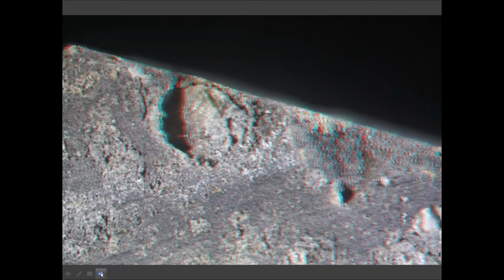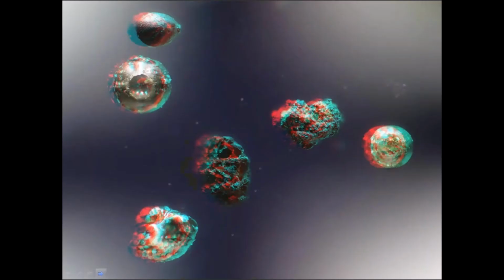Another great application is geology. This is a meteorite from the moon. And you can see the surface is really, even though it was a cut flat surface, you can see there's lots of important three-dimensional information. And as you get closer, you begin to see the sorts of fractures and three-dimensional information that geologists are looking for. These are micrometeorites from outer space. They were once falling stars. And you can see some of them are actually hollow inside. And if we look closer at that with a little high-power lens, you can actually see right inside of this. This is just a tiny little grain of sand, about 0.2 of a millimeter.